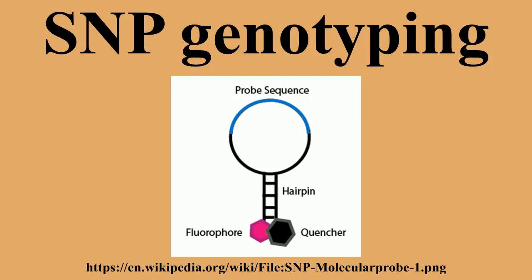By performing a digestion on a genomic sample and determining fragment lengths through a gel assay, it is possible to ascertain whether or not the enzymes cut the expected restriction sites. A failure to cut the genomic sample results in an identifiably larger than expected fragment, implying that there is a mutation at the point of the restriction site, which is rendering it protected from nuclease activity.